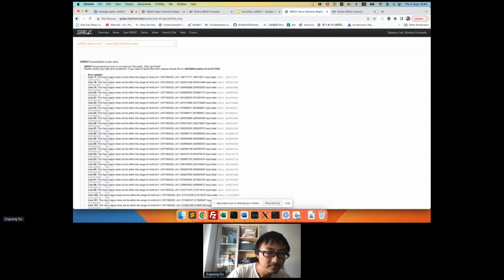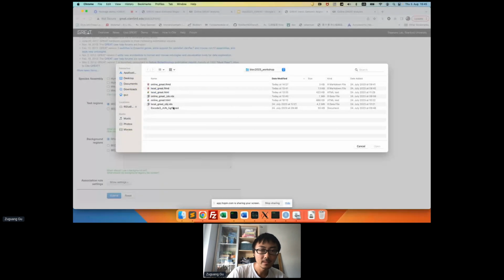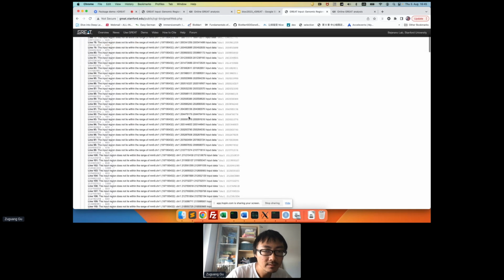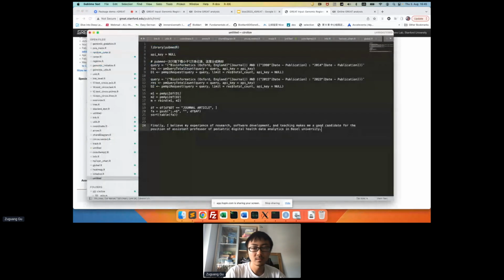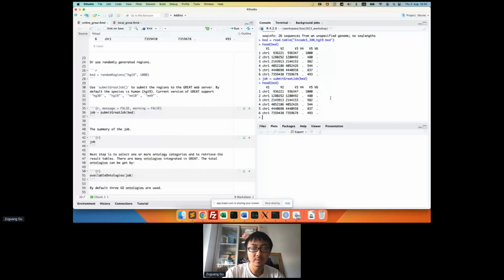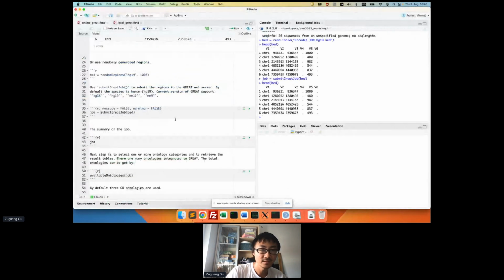Just submit. Oh. Just refresh it. Okay, it's strange. I will just skip using this web service. I will just focus on this R Markdown document.